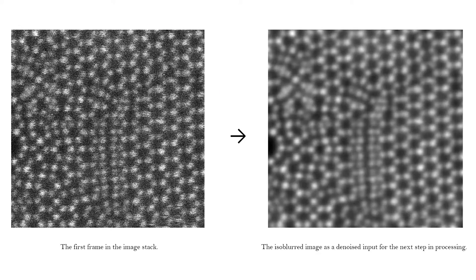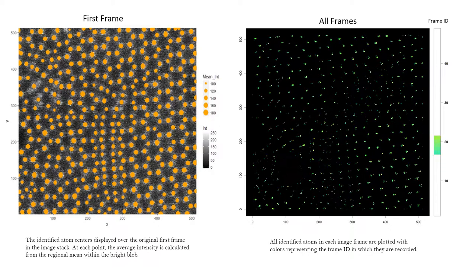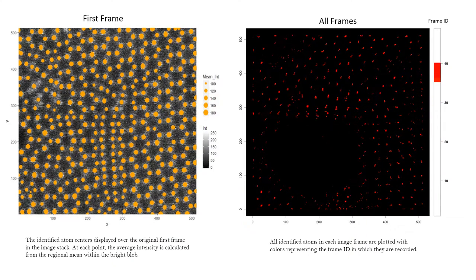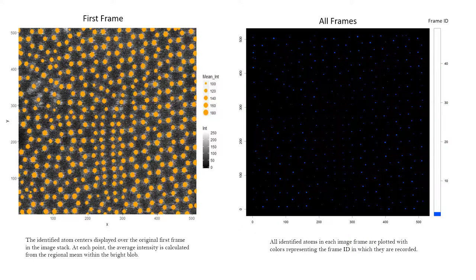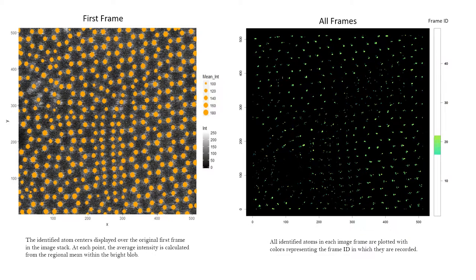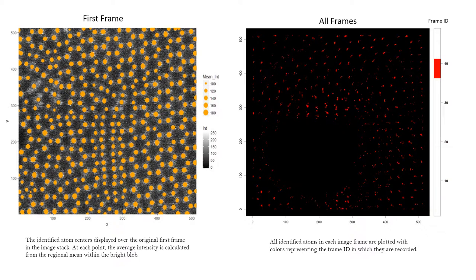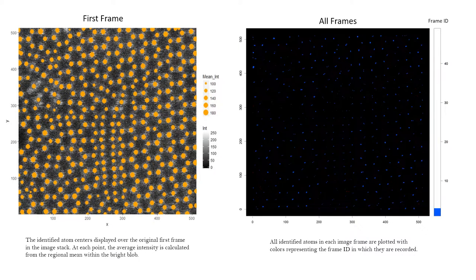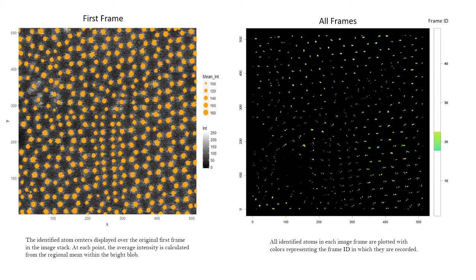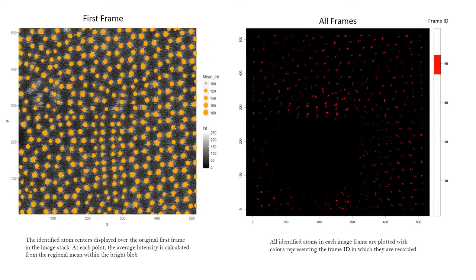In the core of our approach for center detection, we calculated the second-order partial derivatives of intensities on an image in the form of a Hessian matrix. The maximum of the Hessian determinants were used to pick the possible intensity centers according to the atom positions. The final results of the center detection are shown as a still image for the first frame and a GIF animation for all 49 frames.